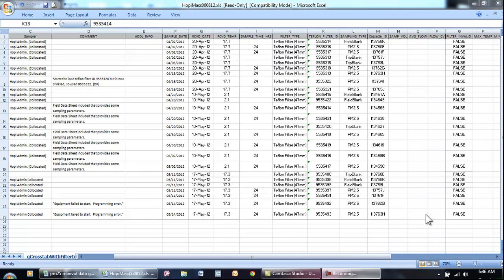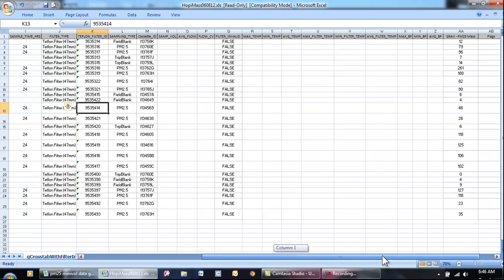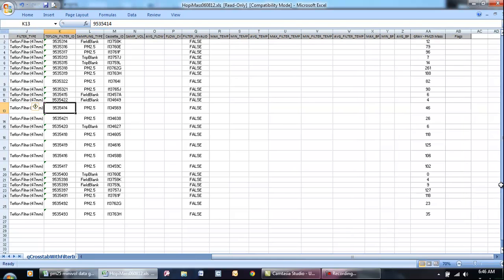Okay, so what do you do when you receive this report from RTI in the mail? First of all, you have to make sure that you're looking at the right report. In general, the title has the word mass in it and not UNC for uncertainty or MDL for minimum detectable level. And one of the things that makes the reports hard to read is that the actual value that you're looking for, the mass value, which then you have to divide by volume, is way out here over in column AA.